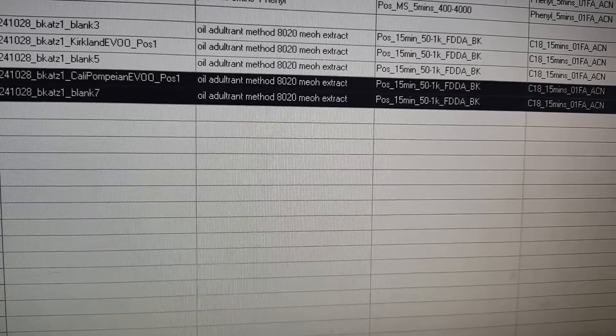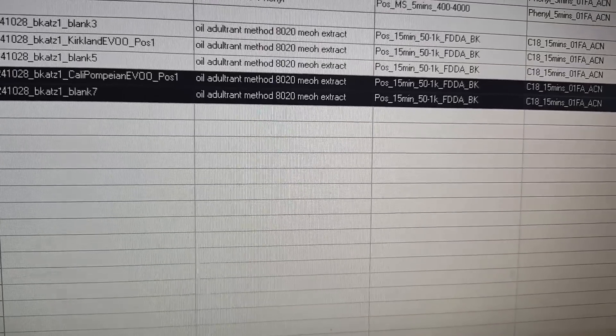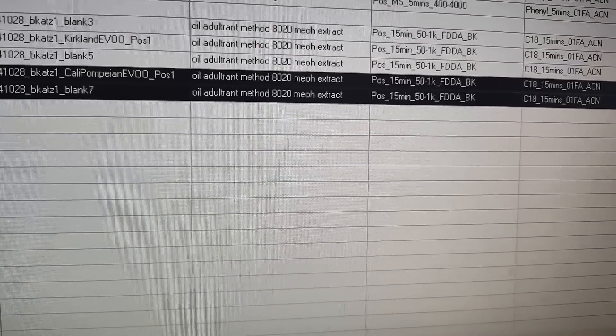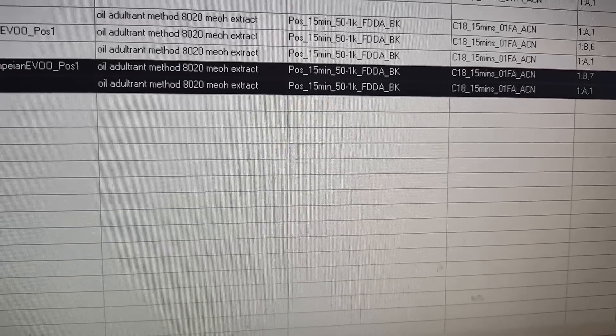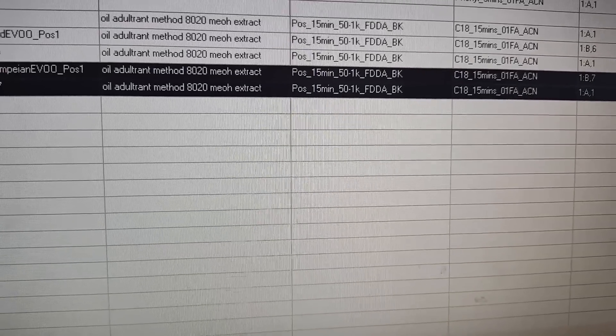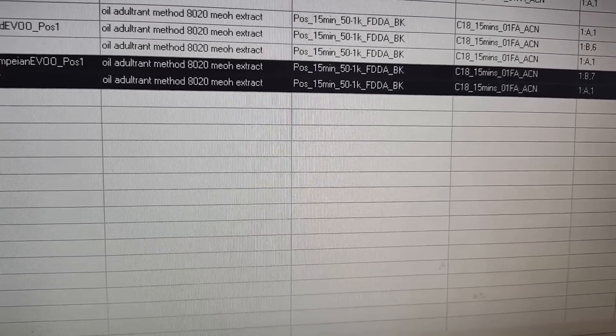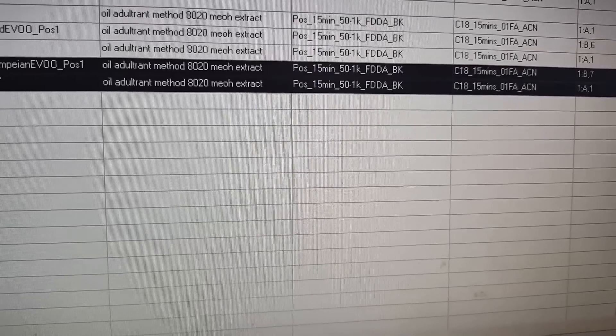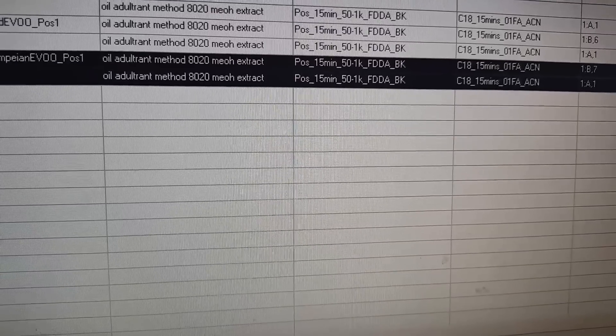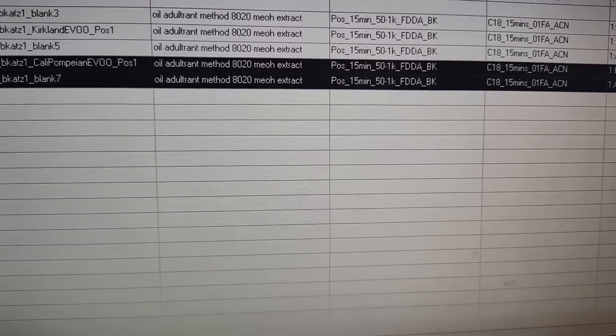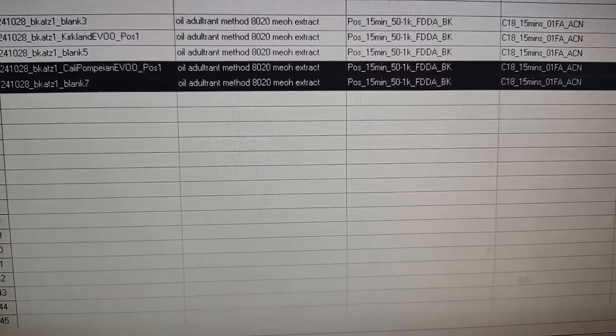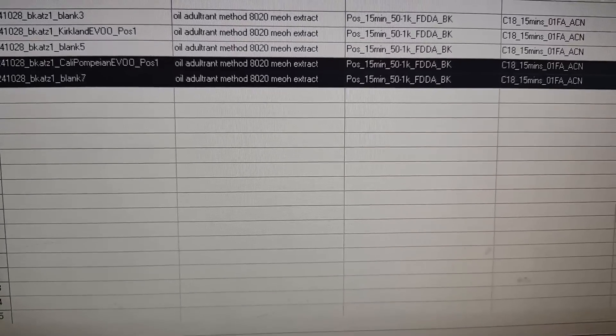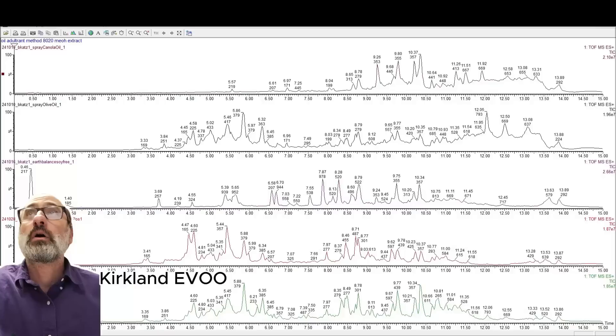So here's our oil adulteration method. This is the C18 column. Formic acid. I show the 15-minute method. Kind of standard data-dependent acquisition. So it should be pretty good stuff. It's the same method I used for the Trader Joe spray oil. So we can compare it to that as well.